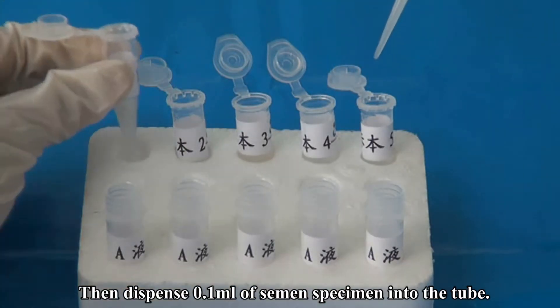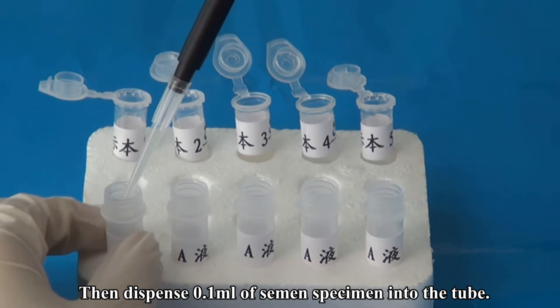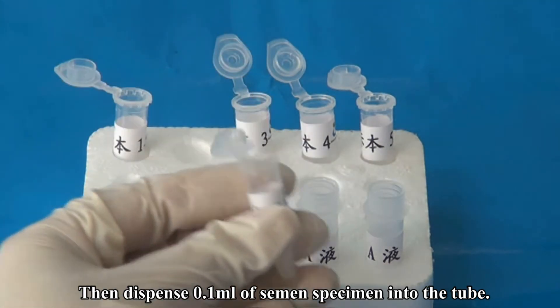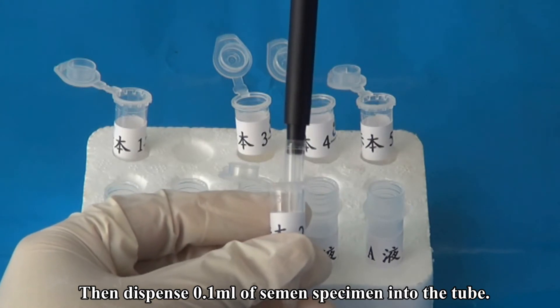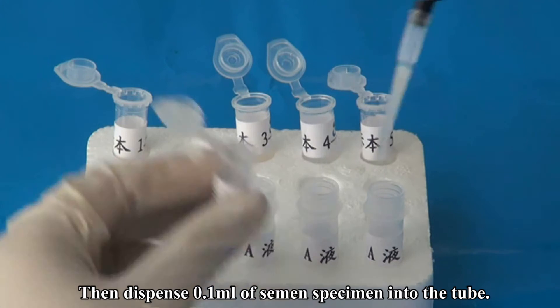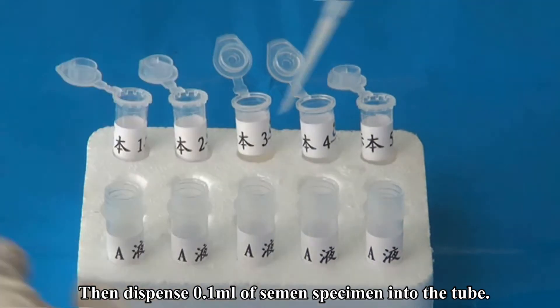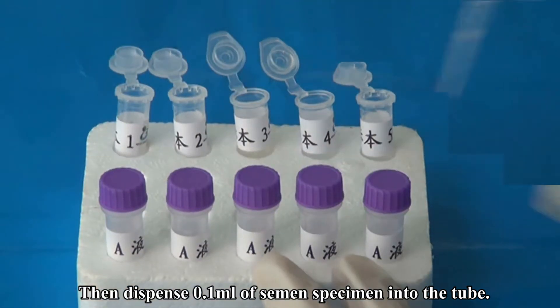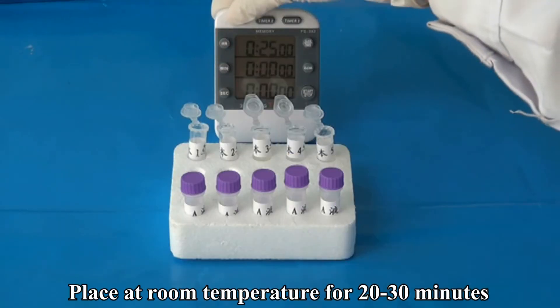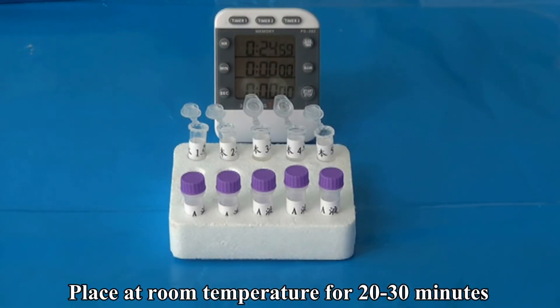Then dispense 0.1 milliliters of semen specimen into the tube. Shake the tube, then place at room temperature for 20 to 30 minutes.